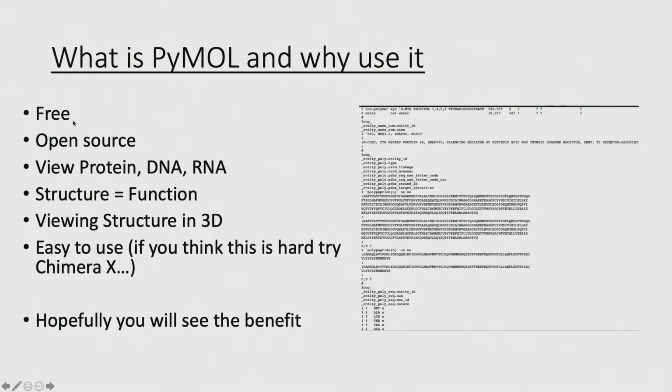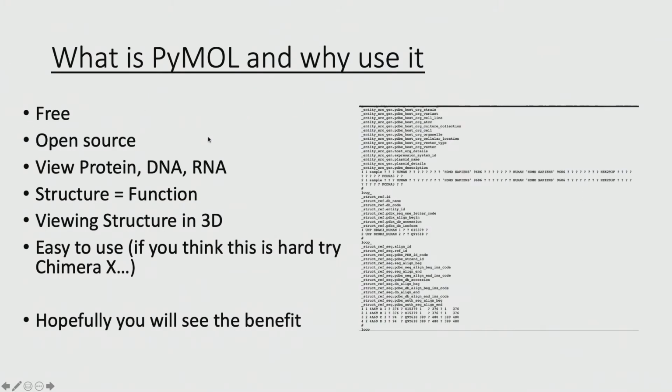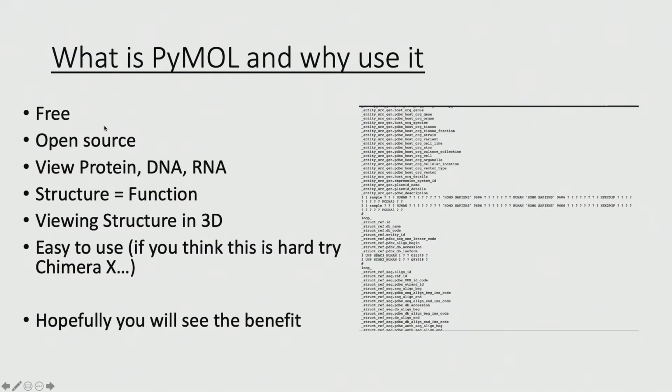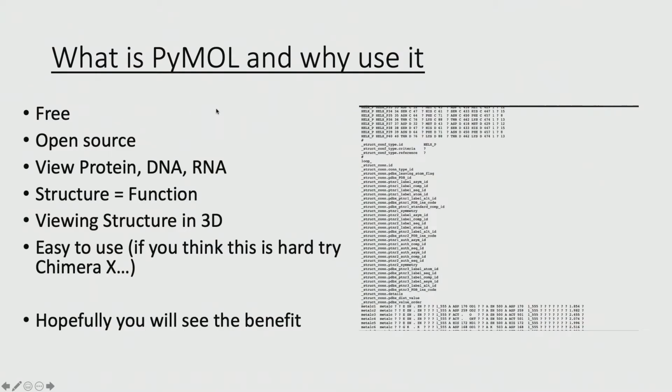It's free to all students. You can download it from the PyMOL website. If you go to Google and type in PyMOL Educational, there's a unique web page where you put in your email address and which university you're at, and it allows you to have an educational license which lets you use this for free. It's open source.